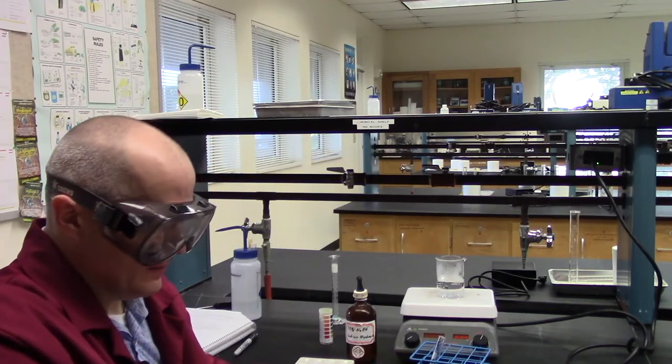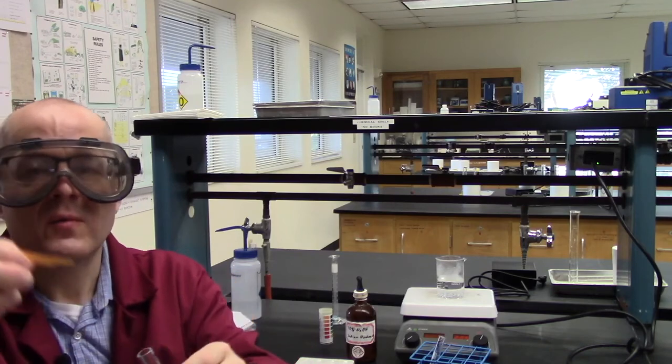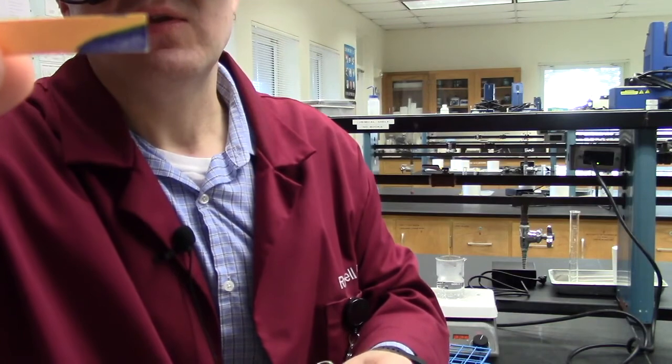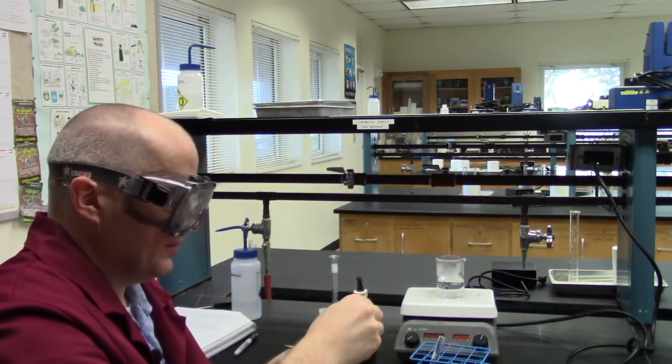And let's check. There you go. See, now it's blue. That's basic now. I've gone a little higher than pH 7, but that's okay. We'll be okay.